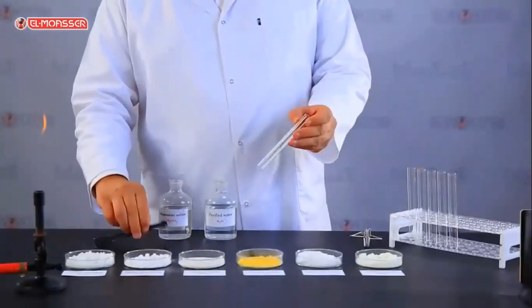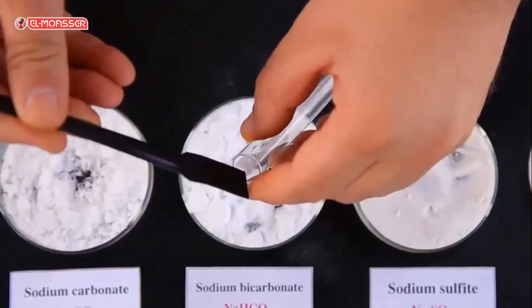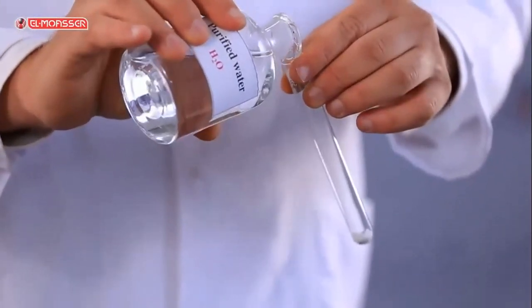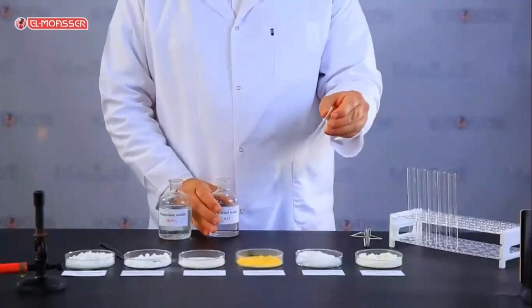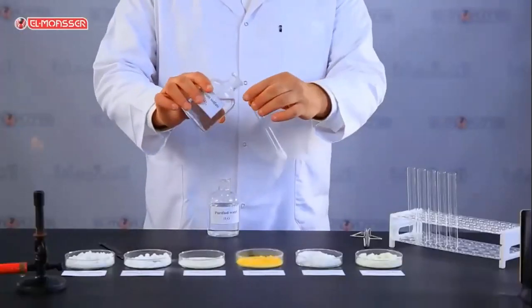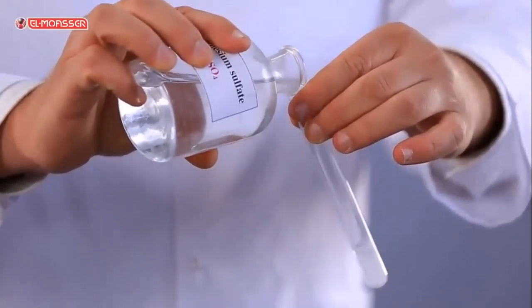Confirmatory experiment. Add a small amount of sodium bicarbonate salt to a clean test tube, then add distilled water with shaking to form a solution. Add magnesium sulfate solution to the prepared sodium bicarbonate solution.